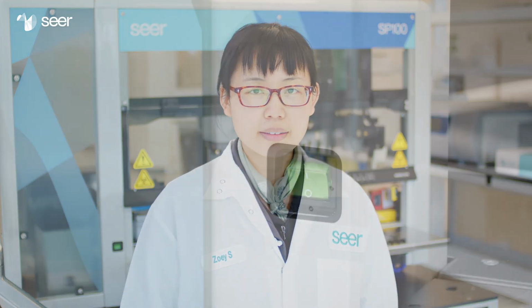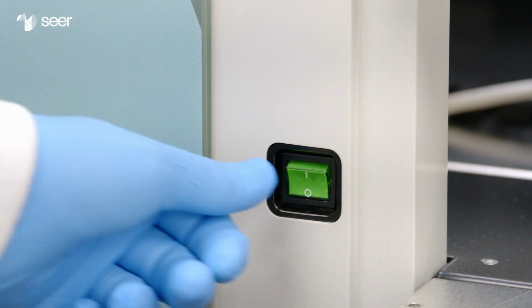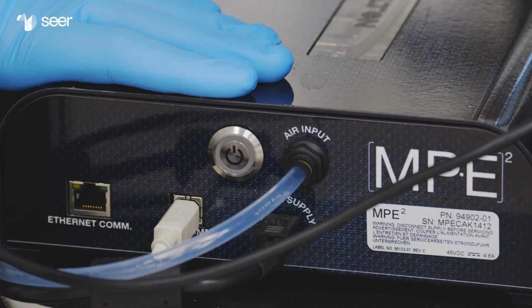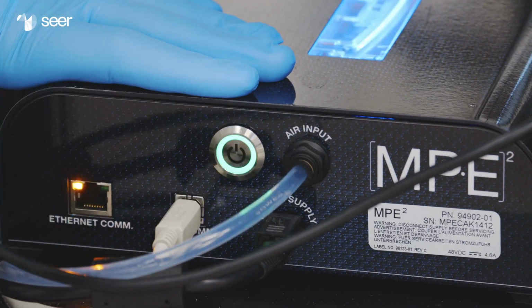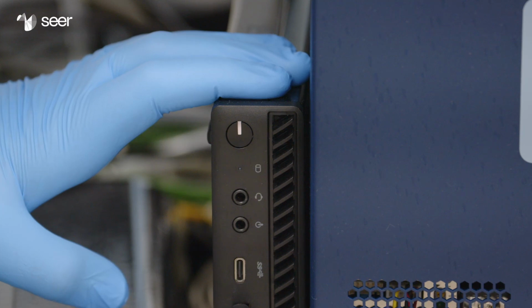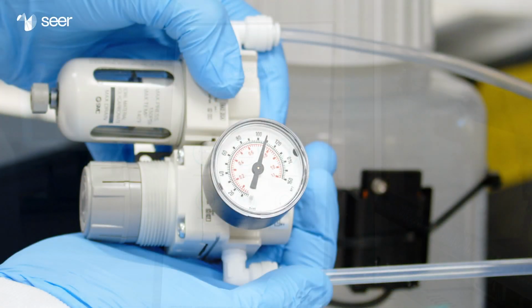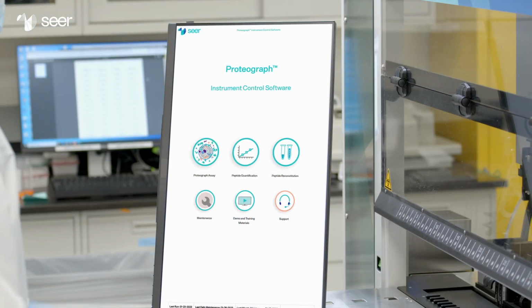Preparing to perform peptide reconstitution. If the SP100 is not already on, turn on the SP100, the MPE power unit, chiller power unit, and the instrument computer. Check the gas supply and the MPE regulator for the appropriate pressures, and launch the ICS.